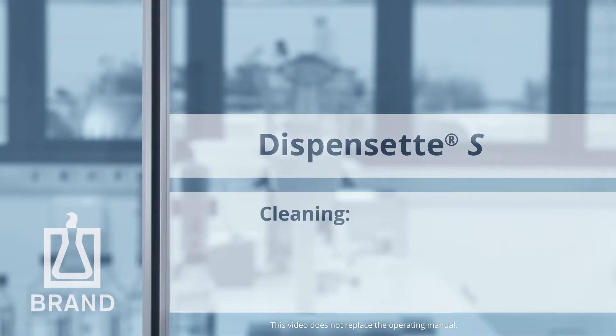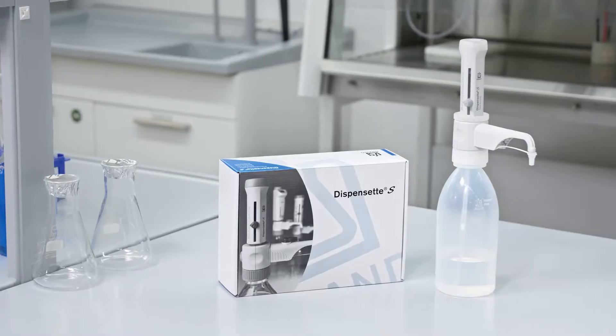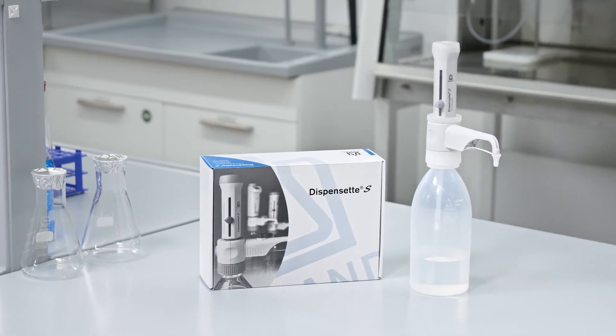We recommend cleaning your Dispenset S immediately when the piston is difficult to move, regularly when using liquids which tend to form deposits like crystallizing liquids, and prior to autoclaving. The trace analysis model has a different design. Please consult the operating manual for cleaning instructions for this model.